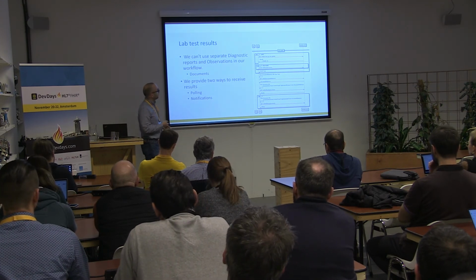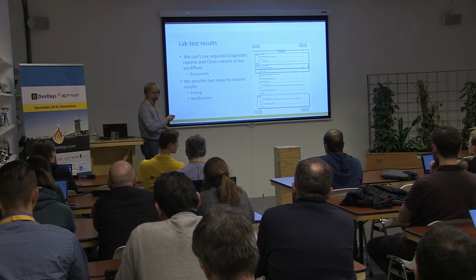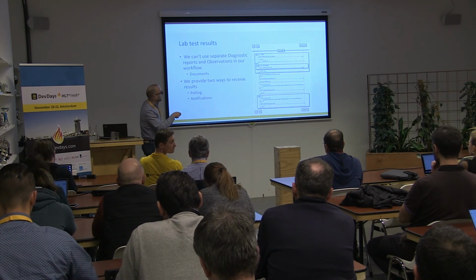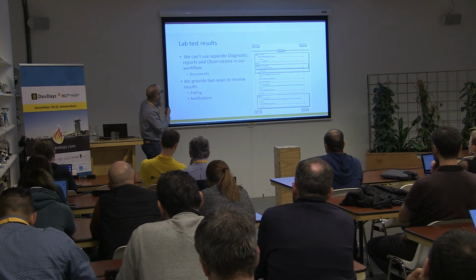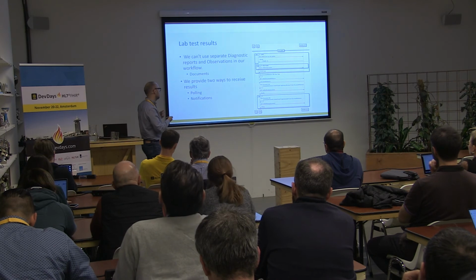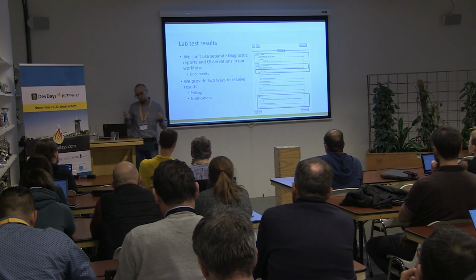In FHIR, we can make both of these ways to do it. And if the task has changed, then the customer should take this task's output, take the link to documents from it, and then take the information, whether it is a structured document or maybe a PDF version of the result.